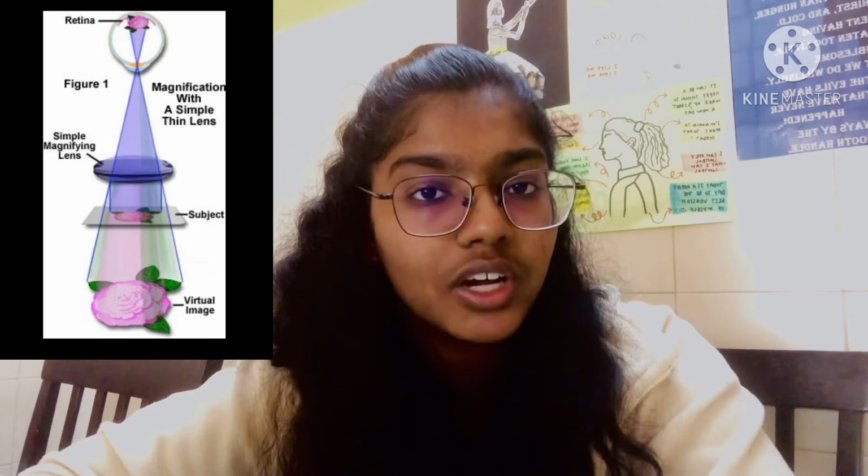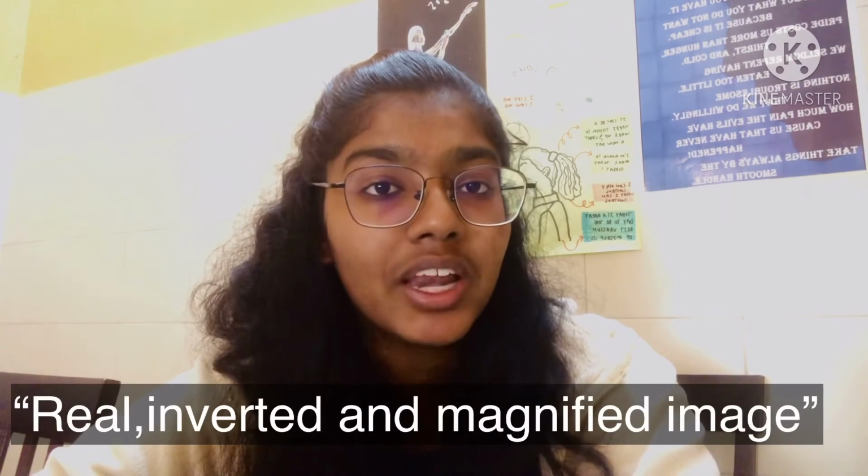And now I would like to explain image orientation and magnification. The first lens, which is closest to the specimen being examined, is the objective lens. Light from either an external or internal source within the microscope body is first passed through the substage condenser, which will form a well-defined light cone to be concentrated on the specimen. The light passes through the specimen and into the objective lens, which projects a real, inverted and magnified image of the specimen on a fixed plane within the light microscope, which is termed the intermediate image plane.